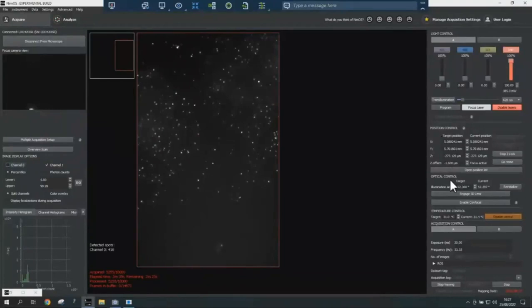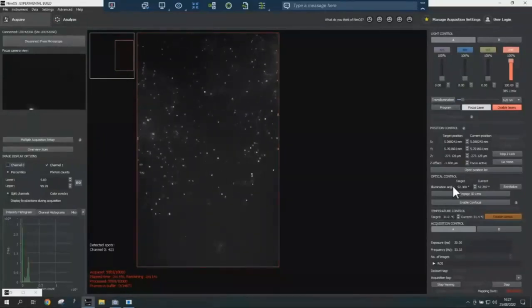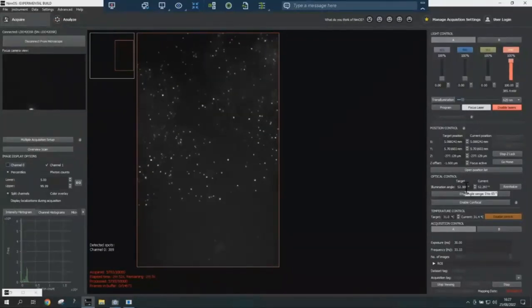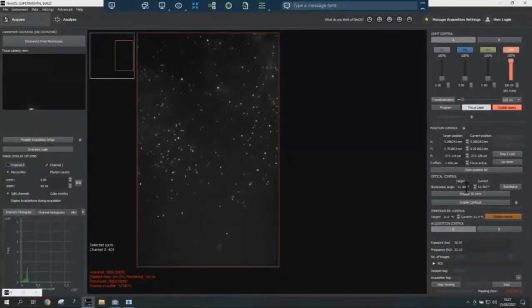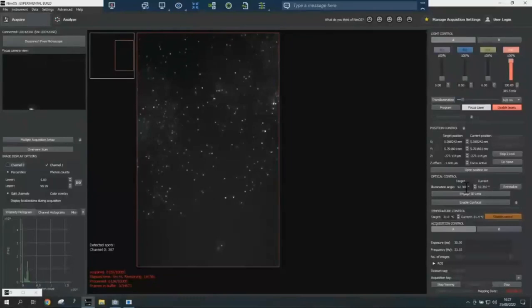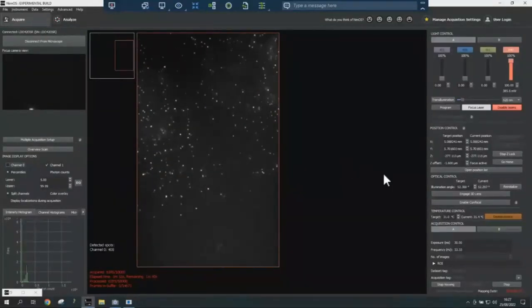We also have the possibility to change our illumination angle. At the beginning it was at epifluorescence, so the laser went straight to the sample and you could reach deeper planes. But in this case, we're putting it at very high inclined illumination or even TIRF illumination. This means we will have less excitation in our sample, but as you can see, it greatly improves the signal to noise ratio, which is very important for single molecule localization microscopy.